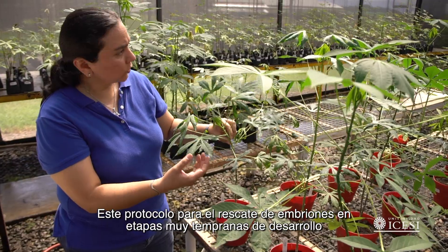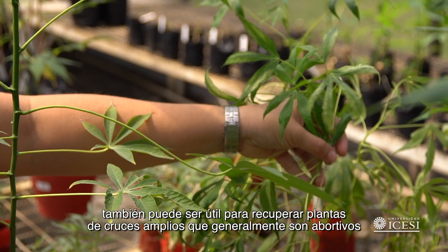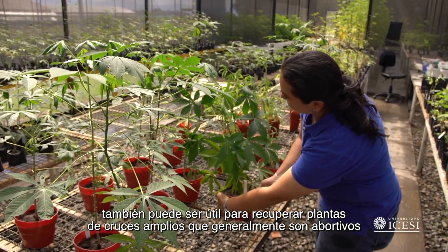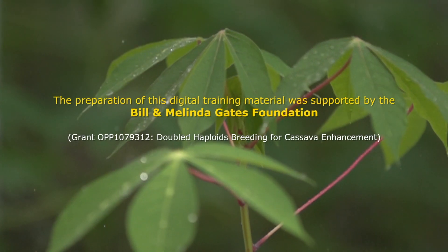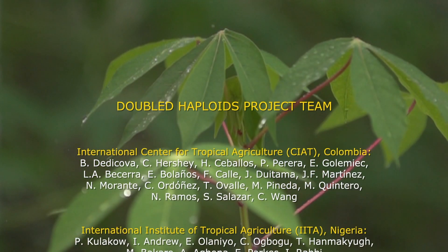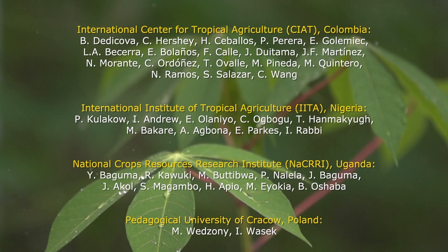This protocol for embryo rescue at very early stages of development may also be useful to recover plants from broad crosses, which are usually abortive.